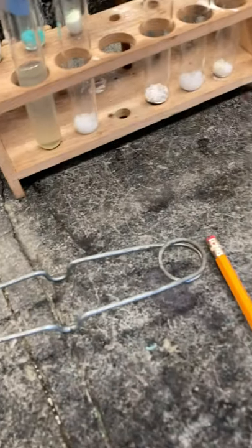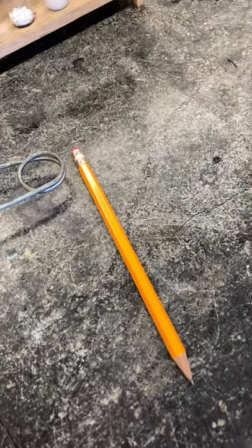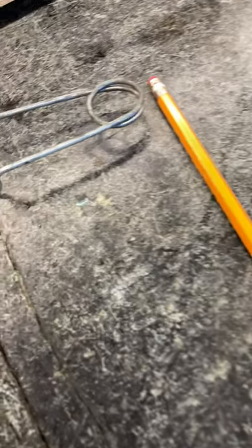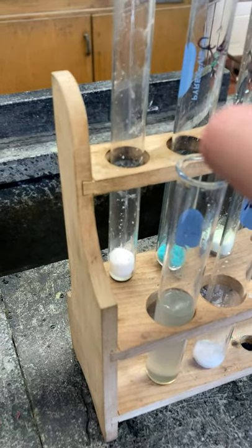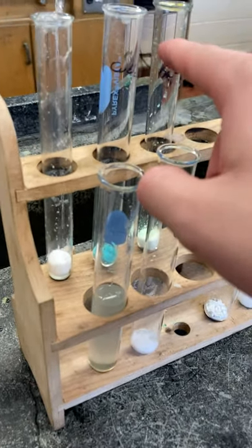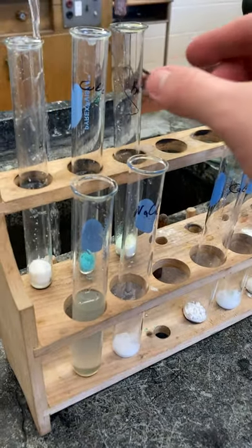Alright, so this one's orange too, though. Okay, so what's this one? C-A... I think that's calcium. C-A-C-L-2 is what it says. I think that's calcium for sure. Calcium? And then this one's what? This one was yellow, right? This one was yellow-green. This one was blue-green. This one was yellow, right? Yellow-orange. This one's yellow-orange.